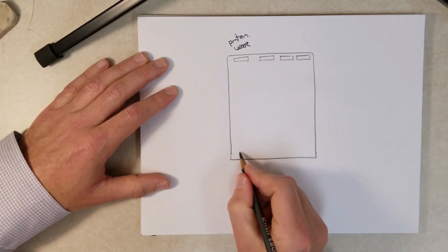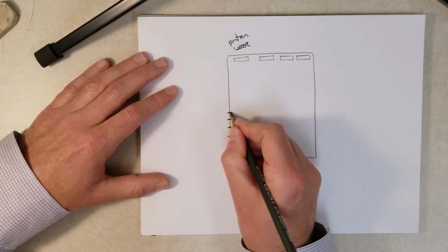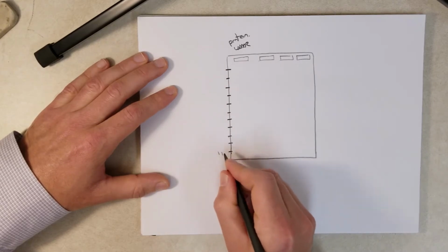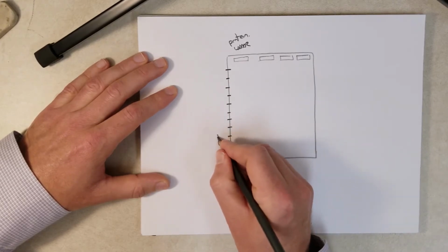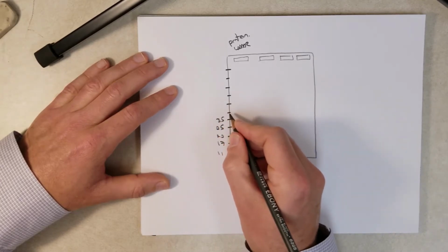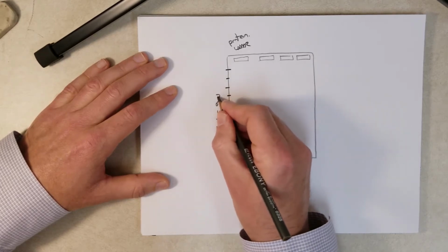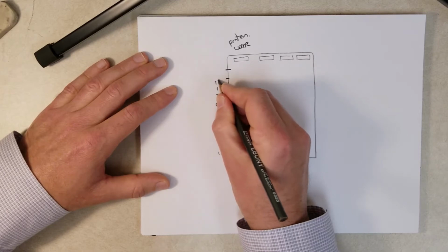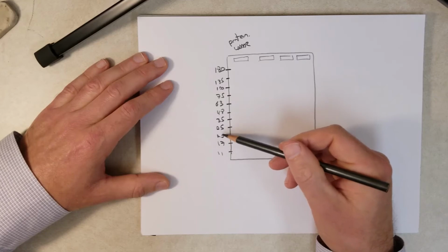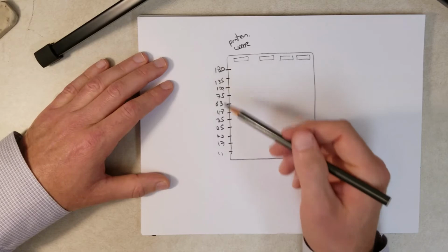So now here's one I looked up on the internet, just a standard protein ladder that we could buy from a biotechnology company. And the weights are in kilodaltons, and proteins are usually measured in units of kilodaltons. So these are kilodaltons over here. The numbers aren't too important. 11, 17, 20, 25, 35, 48, 63, 75, 100, 135, 180.